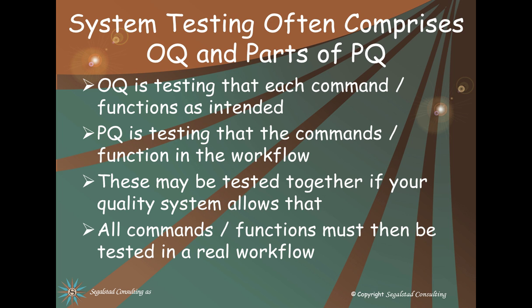This is very often tested by the supplier as well. And if we have access to that, then we don't need to do all the same testing. The PQ is testing that these commands or functions work well in the workflow that we have in our organization. We can test these together if your quality system allows it.